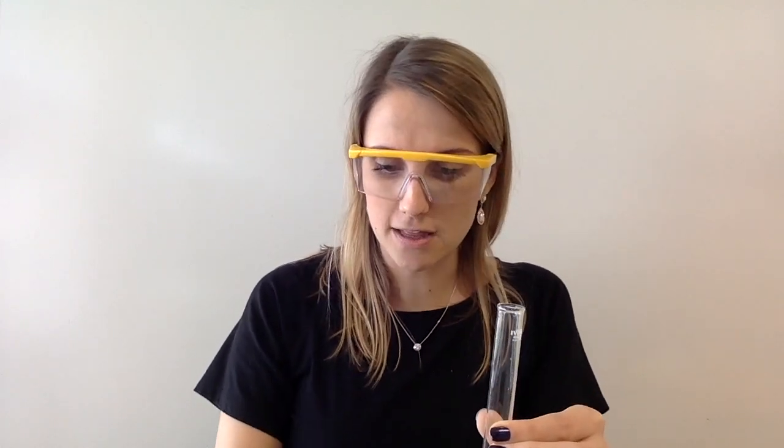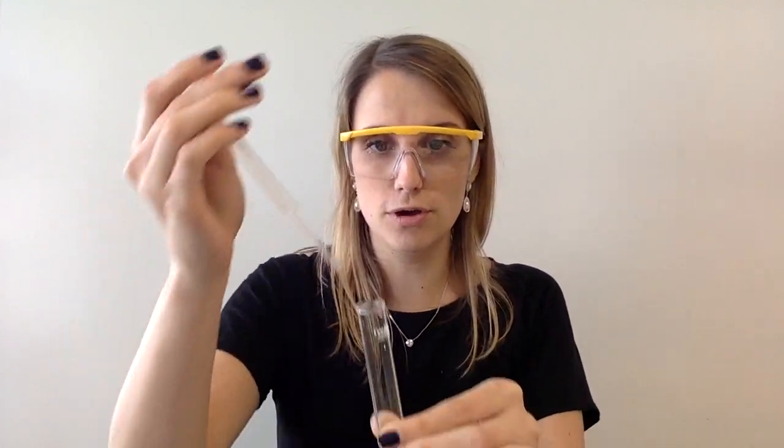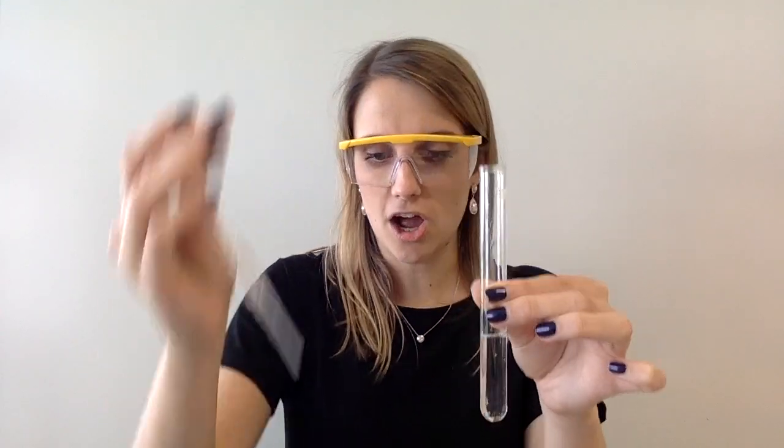Now the reason that we do this is to remove impurities. This means that if there's any carbonate or anything else in there that I don't want, it will react with the acid and won't react with the reagent that tests for the sulfate ions.